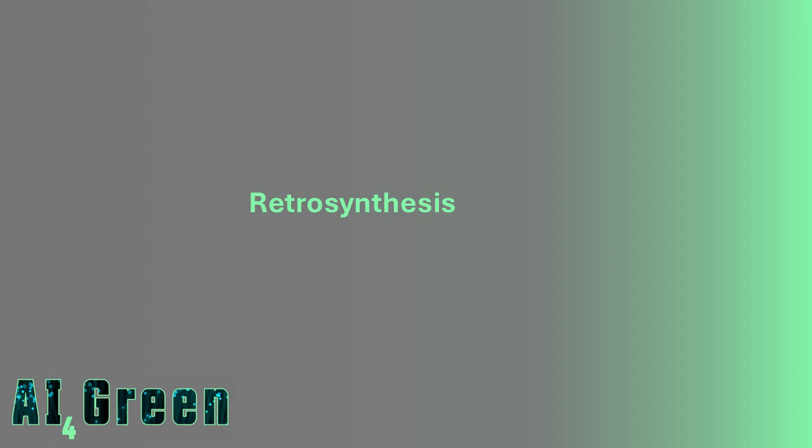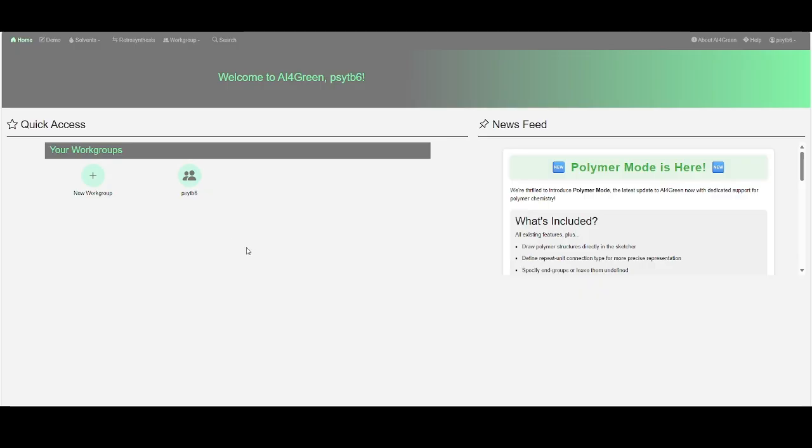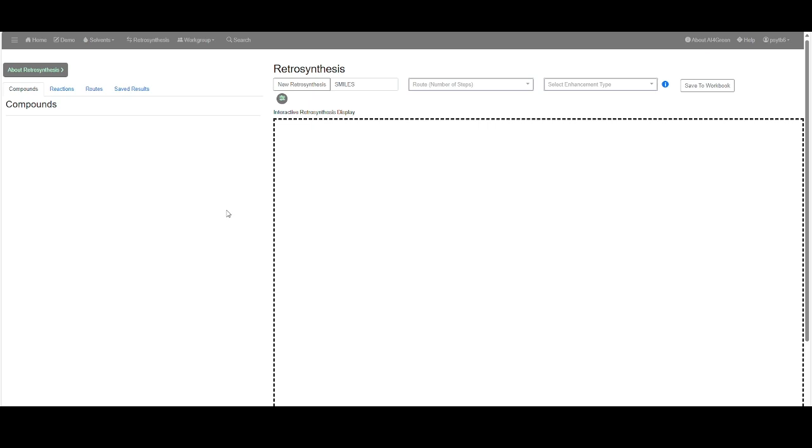Hi, welcome to this short video tutorial on our retrosynthesis software in AI for Green. To access our retrosynthesis software, one must click on the top Retrosynthesis tab in our AI for Green app homepage. That will take you to the following screen.